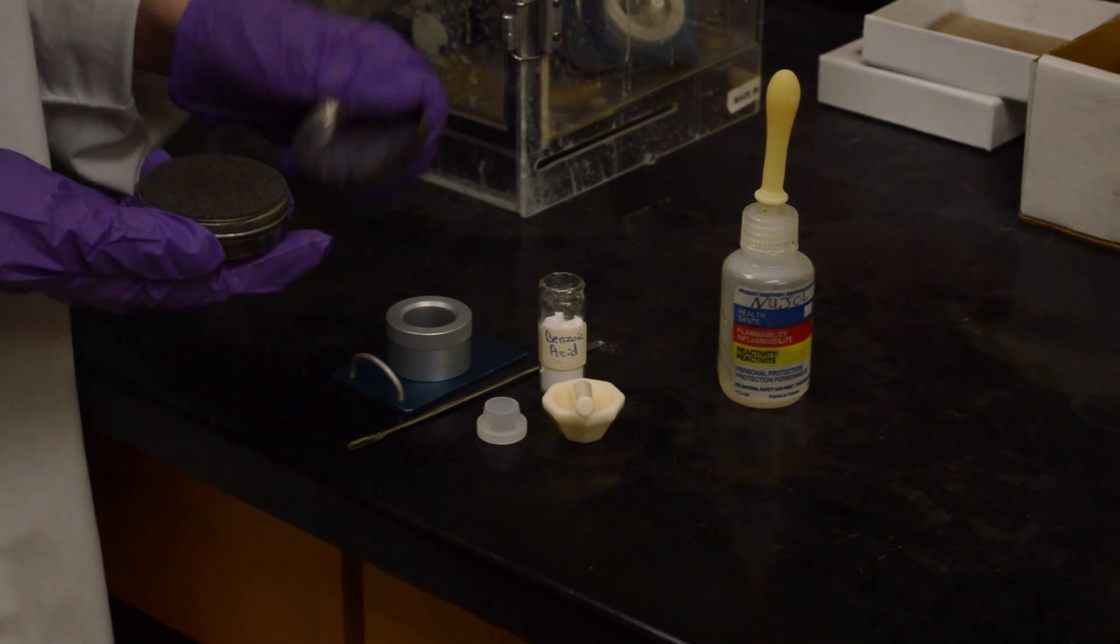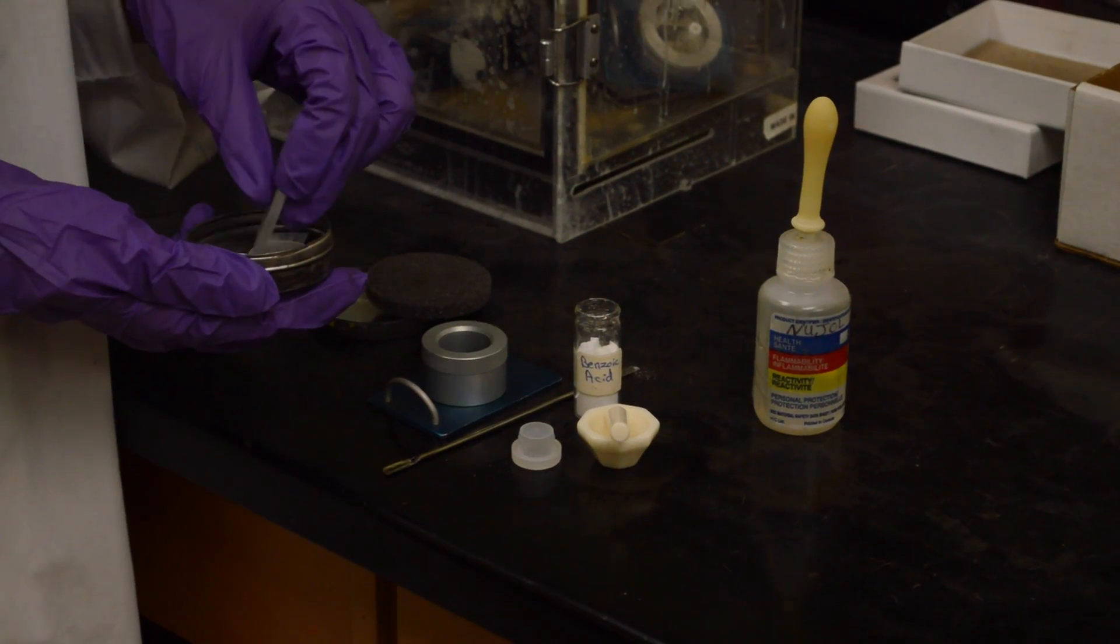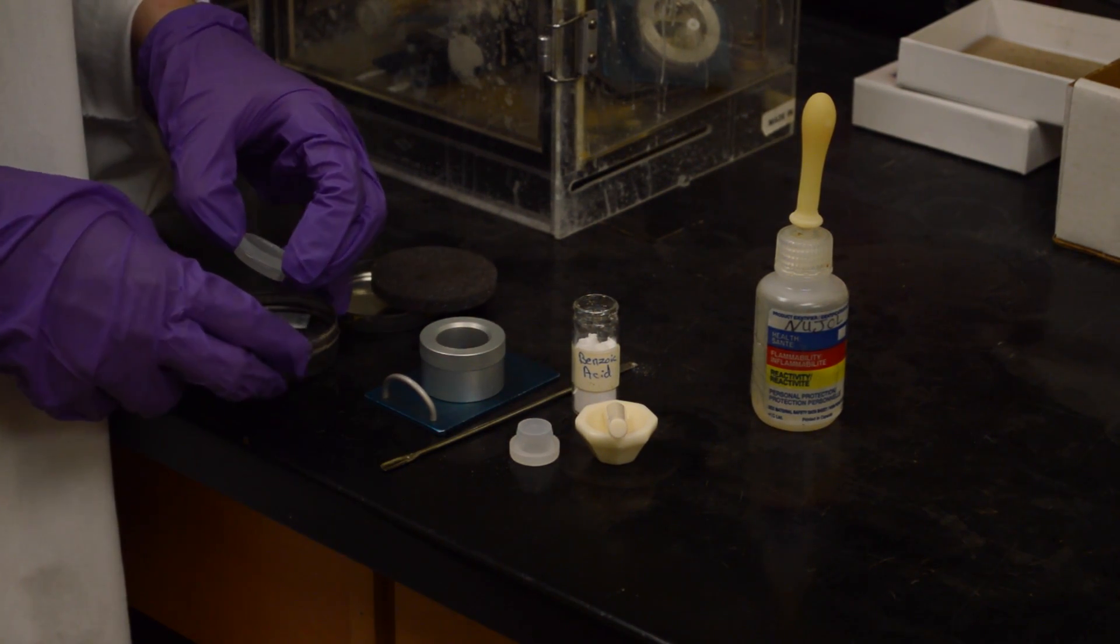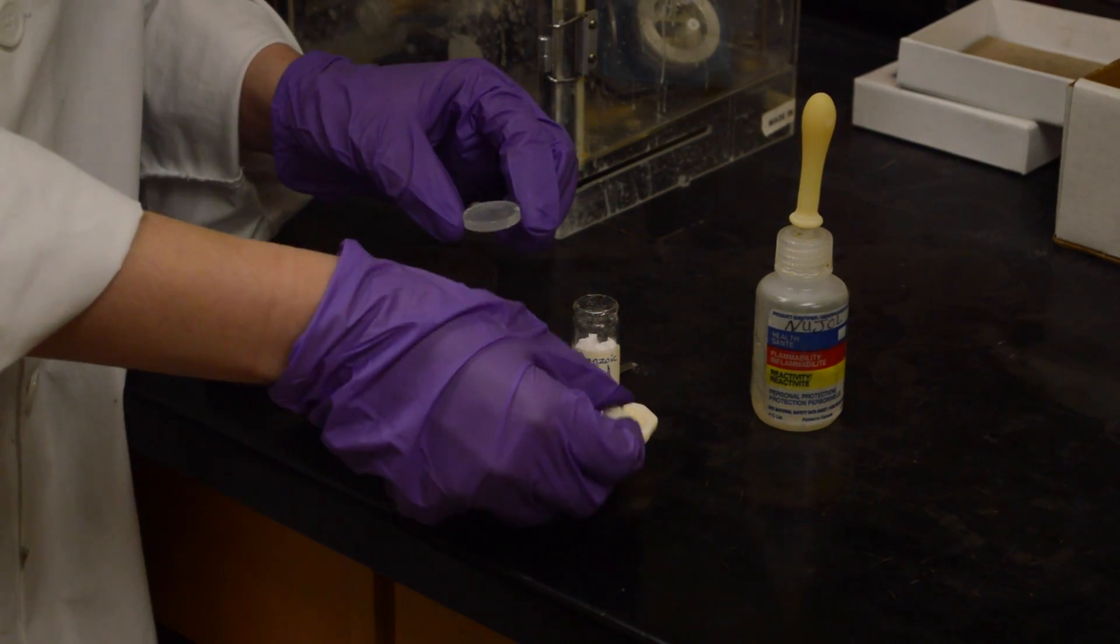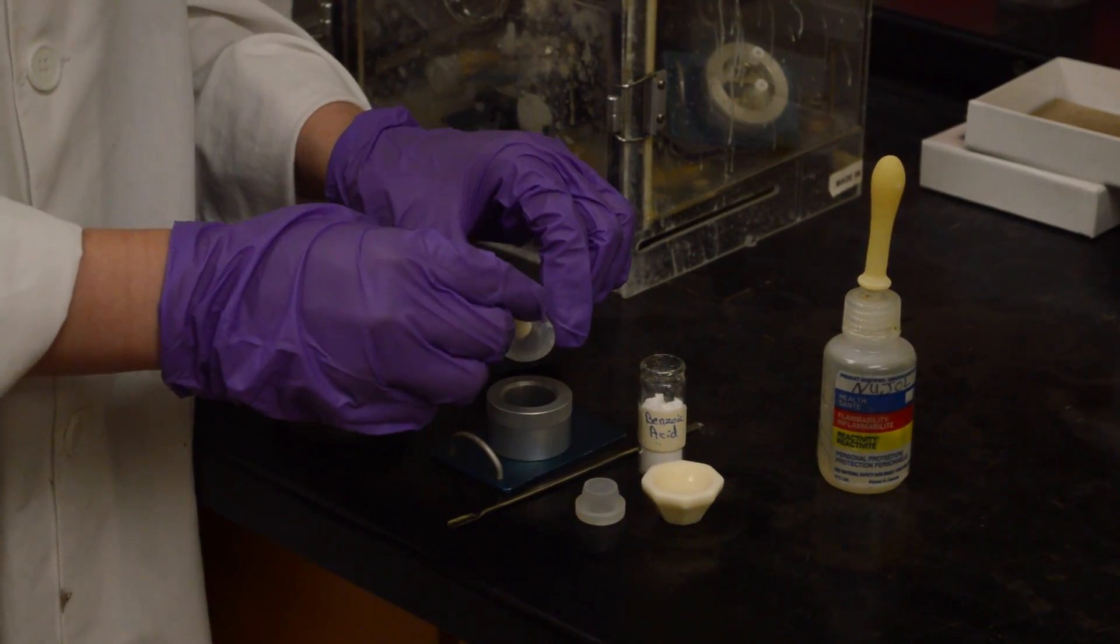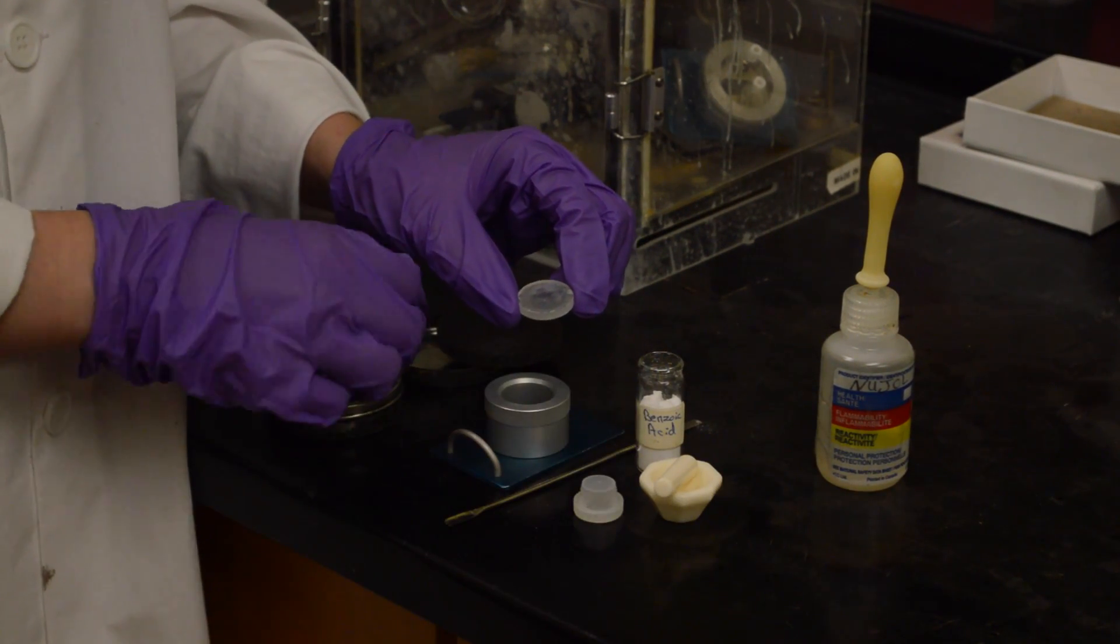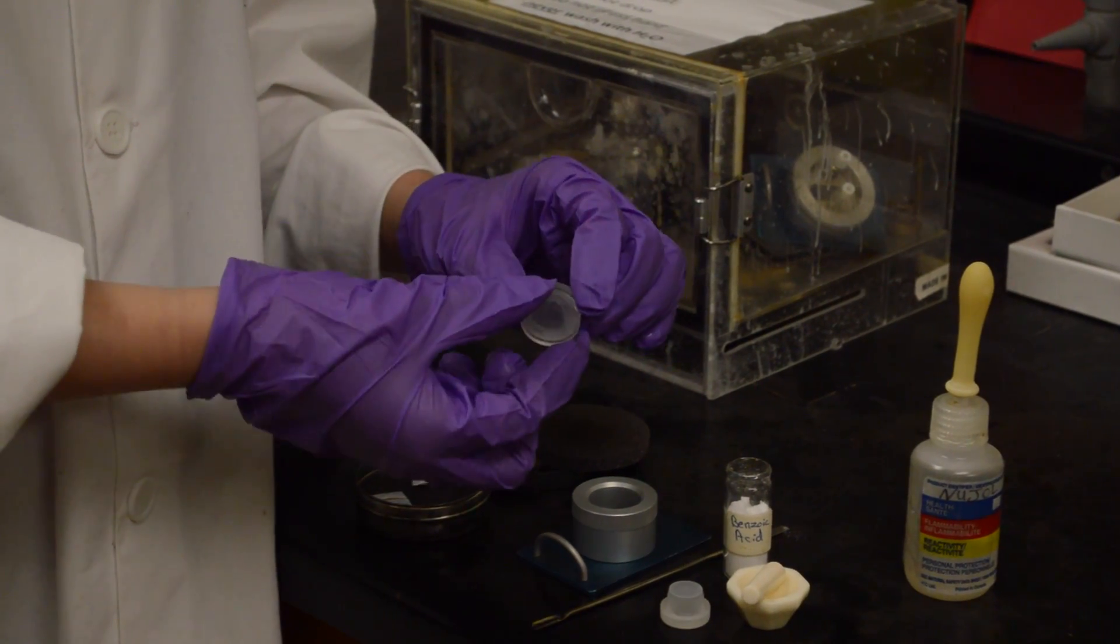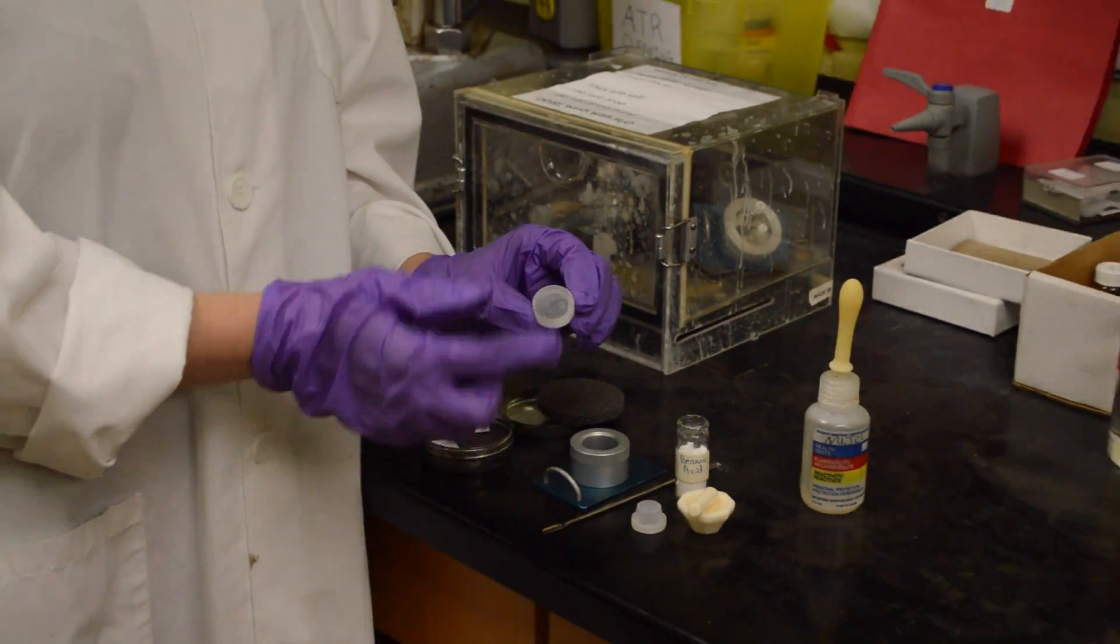Then you take the salt plates. Never put them in water. Never put them in water. You want to spread a small amount, a couple of dots on the plate like so. Then you take the second plate and you squish them together and turn them back and forth a couple of times in order to spread that paste throughout the plates.